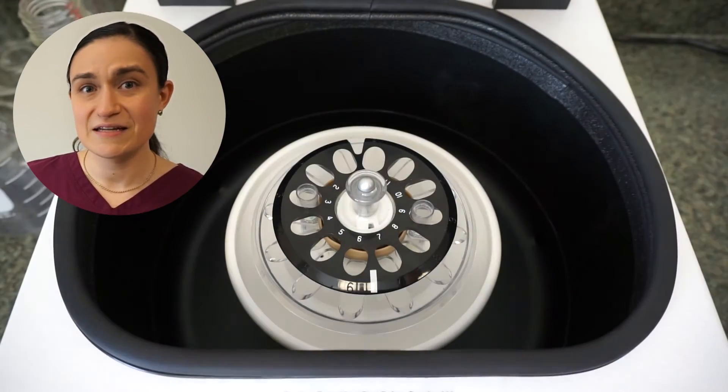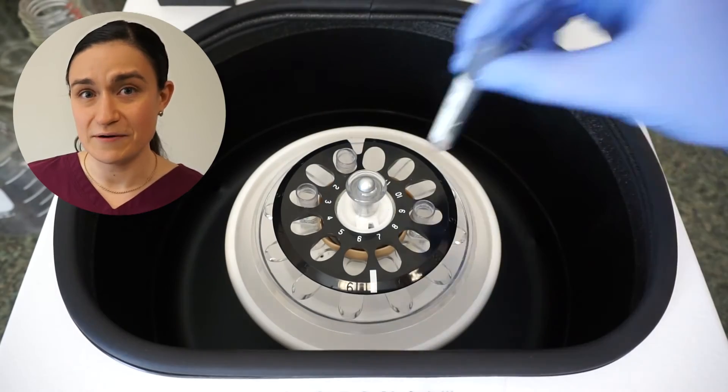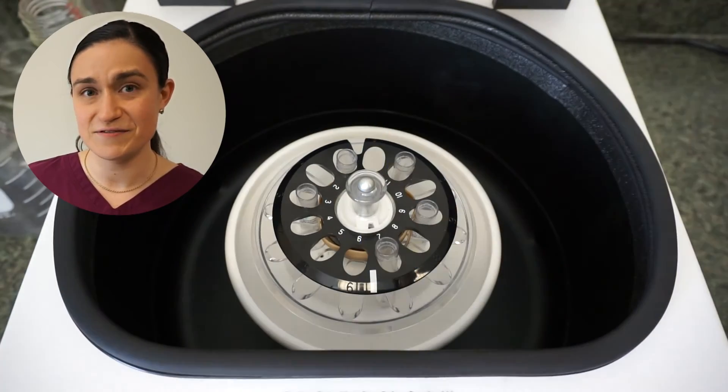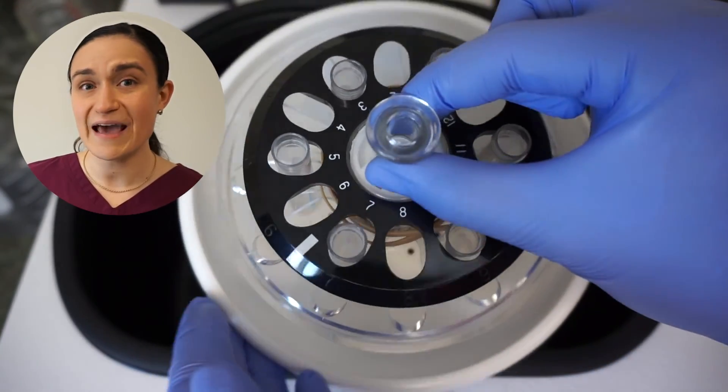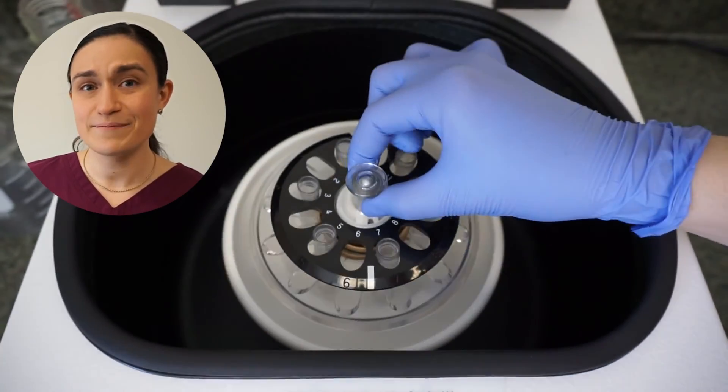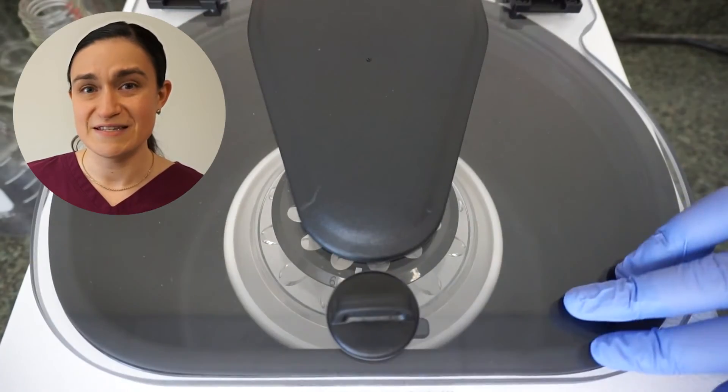Keep in mind that while we have chosen to load the SARA-12 rotor inside the centrifuge, this rotor is completely removable. If you like, you can load it outside the centrifuge and then place it on the spindle once it's time to spin.